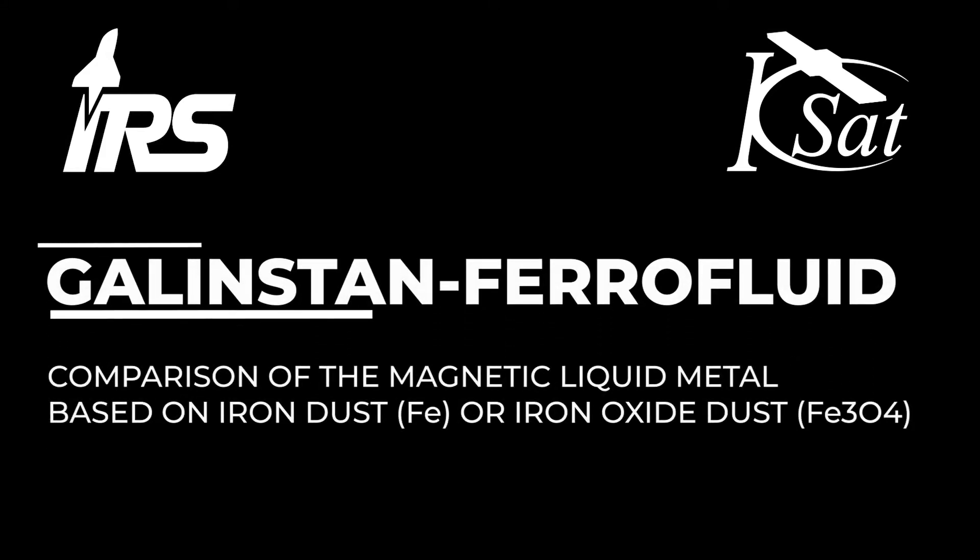Welcome to our ferrofluid experiment, using iron oxide as well as iron dust in Galinstan.